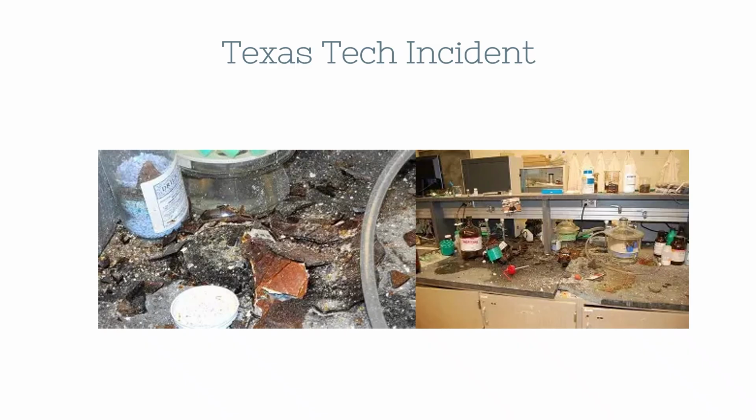Today you guys are going to act as investigators from the Chemical Safety Board, and that's a federal agency that investigates chemical incidents to determine their cause. You will use the information gathered by junior investigators, as yourself, and conduct your own research on this accident, the overall cause, and develop a plan of action that all other academic laboratories can use to avoid similar issues.